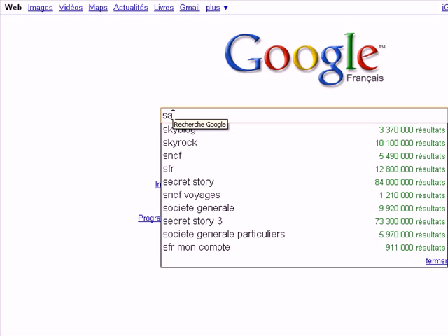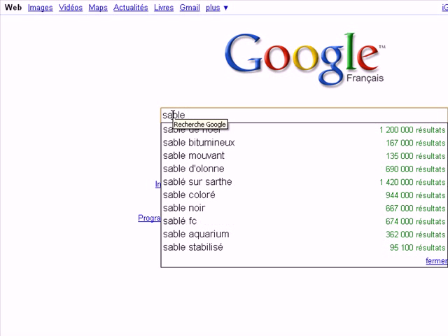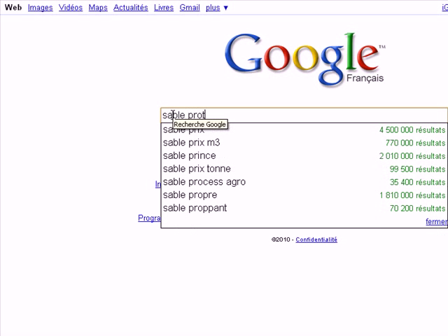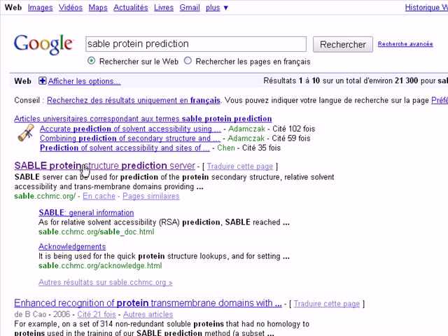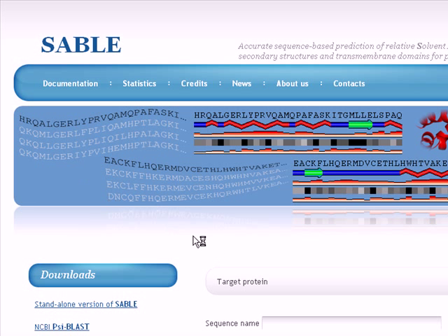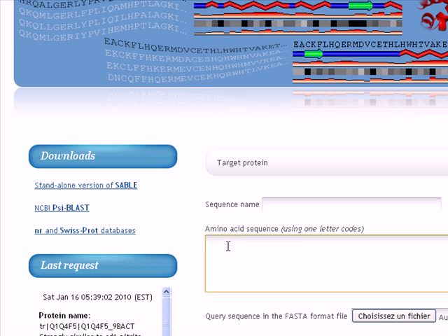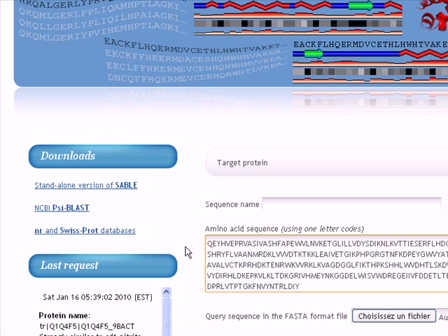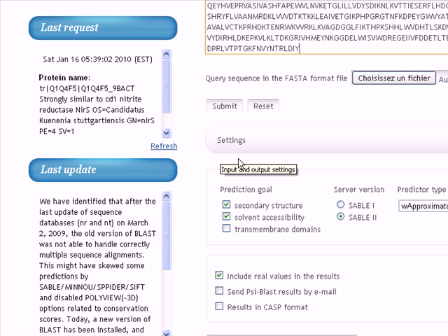We go to Google, write SABLE, for example protein prediction, and we hit enter. We click on the first hit, which is SABLE.cchmc.org. Okay, this is our program. We paste our amino acid sequence here in the settings section.